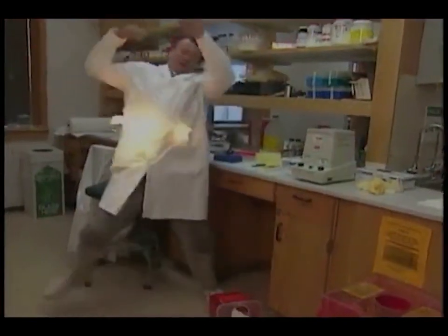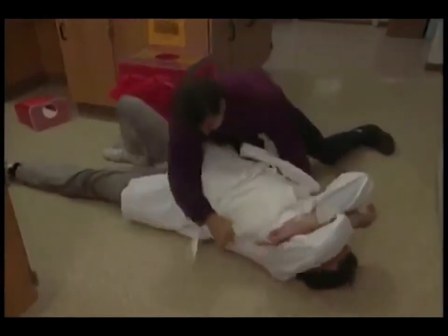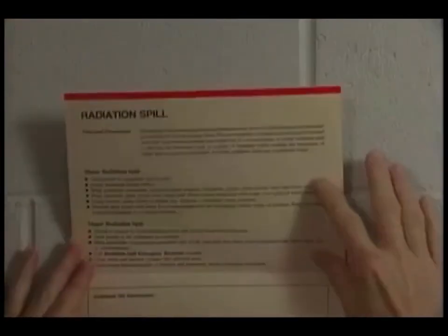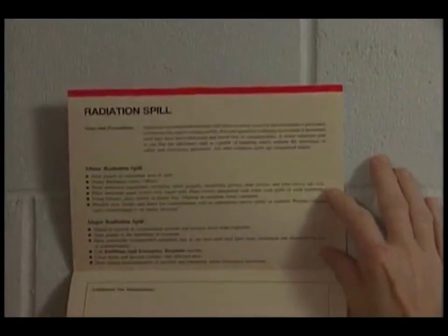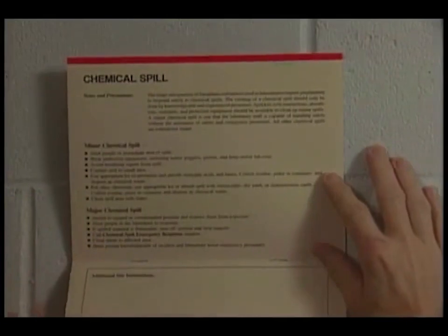Solvent fires, the type most likely to be encountered in the laboratory, are best extinguished by smothering, since using water tends to spread the burning solvent. No one intends to have an accident, but everyone can plan their response to one. Know what to do and how to do it. It could save a life someday.